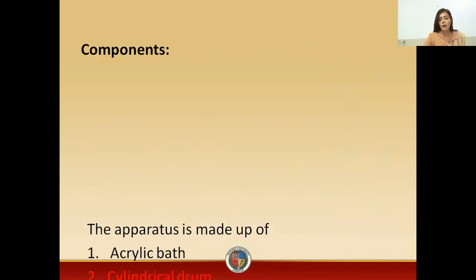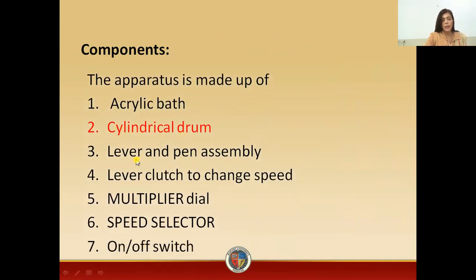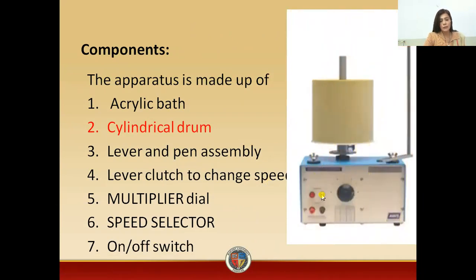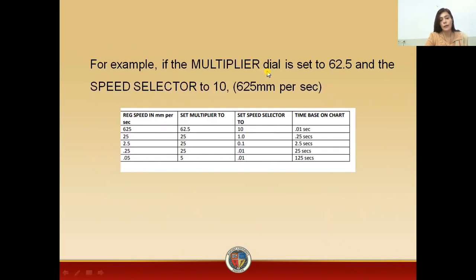Now, what are the major components of the kymograph? It mainly consists of the acrylic bath, a cylindrical drum, lever and pen assembly. Then we have the lever clutch to change the speed, the multi-dial, and the speed selector. There is also an on-off switch, which in this apparatus is on the back. In our lab, we set the multiplier dial at 62.5 and the speed selector is adjusted to 10.